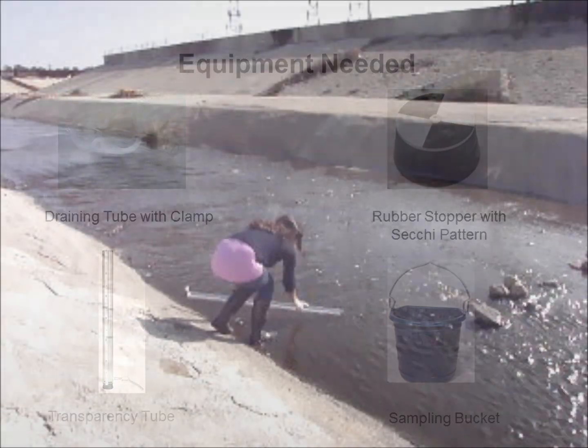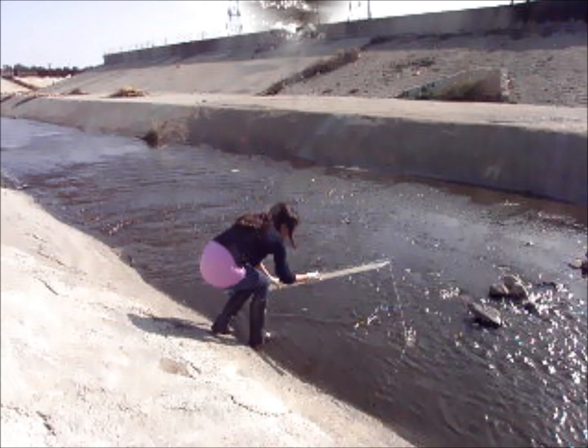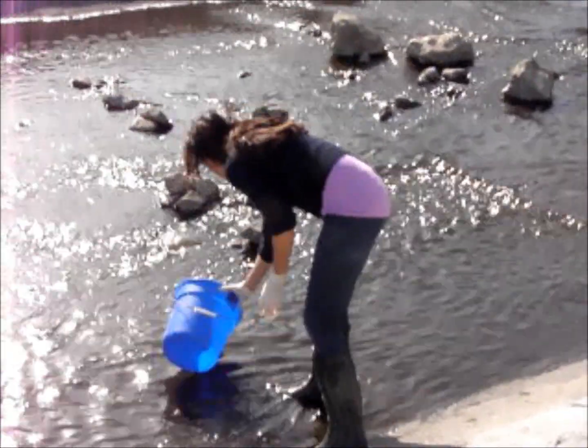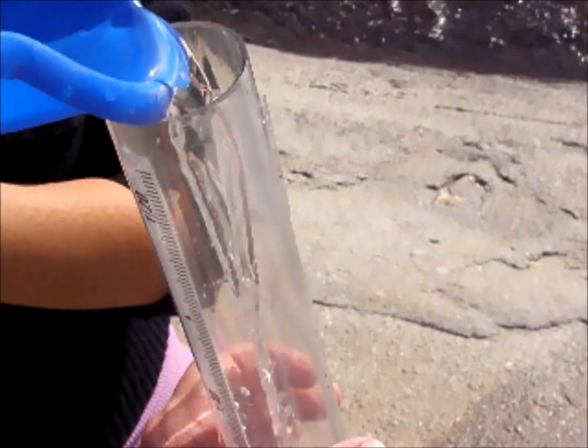Fill the transparency tube with water by either completely submerging it into the water body being monitored, or by using your sampling bucket to collect a water sample and then filling the transparency tube from the bucket.